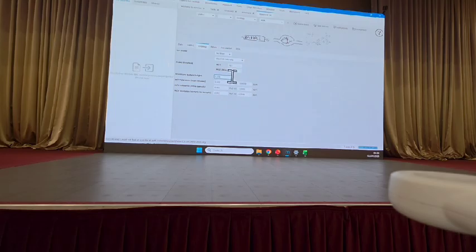Excellent. So again, just to really stress what we're doing, we're trying to tell the software what needs to be considered when looking at each individual point to group bunches of points together to build a peak, i.e. a feature and/or a metabolite. So we've just told the software what signals are noise, junk we don't care about.